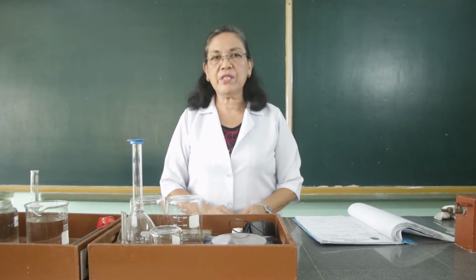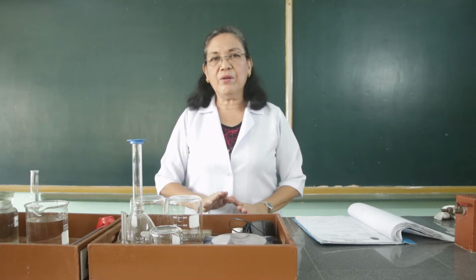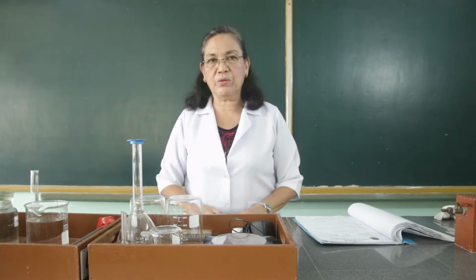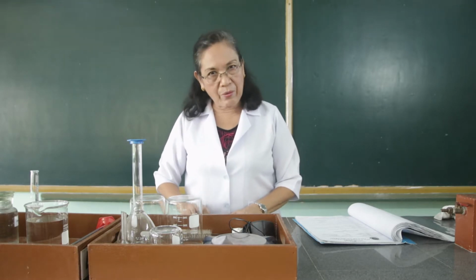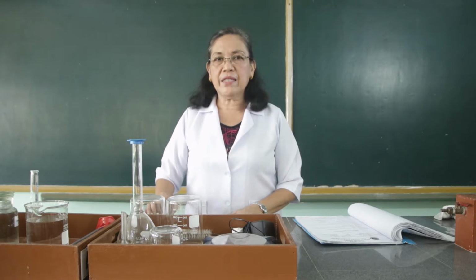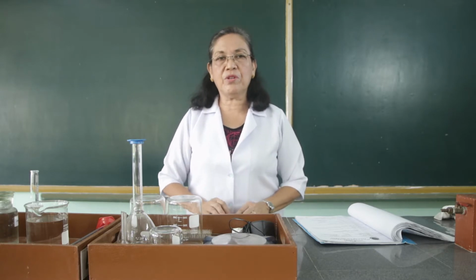So, because we are using a 12 molar hydrochloric acid, that will be our molarity 1. So, the formula will be M1V1 equals M2V2. So, substitute to M1 the 12 molar. For V1 that is our unknown, equals 0.1 times 500 ml. We're going to prepare only 500 ml of this solution.